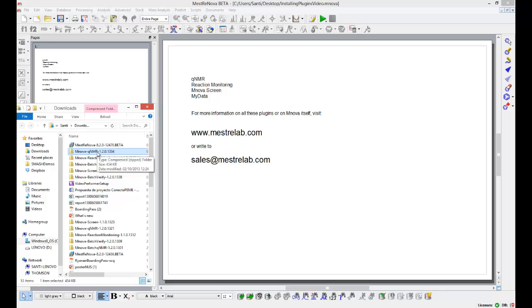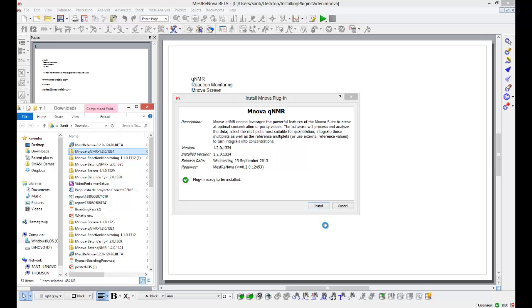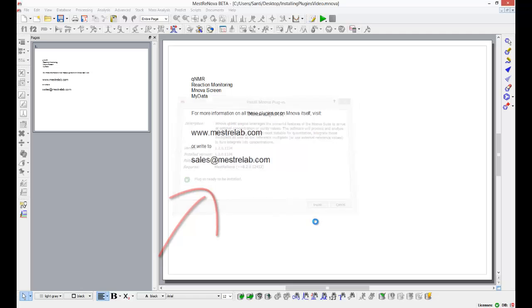All I have to do to add this to my current MestreNova distribution is to select the file, drag it into the software, and this will pop a message that tells me the plugin is ready to be installed.